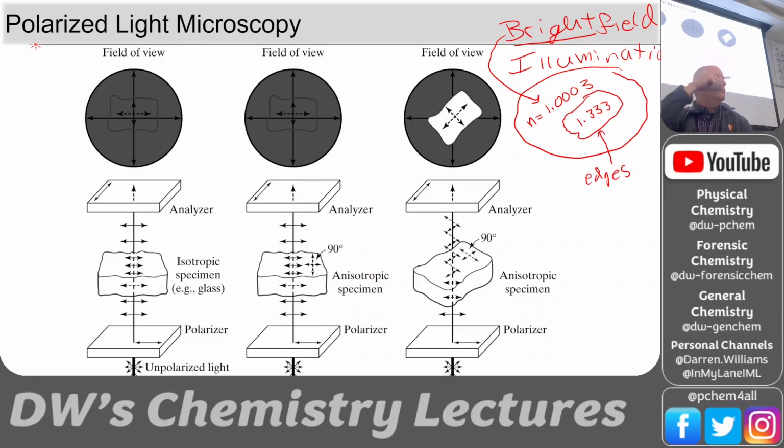edge of that crystal. The reason we see the edge of that crystal is because when light gets really close to the edge of that crystal, it hits the edge and really gets diverted into the crystal because it slows down and gets pulled into the crystal. The light that's just a hair to the right of that goes straight through air and hits our lens.